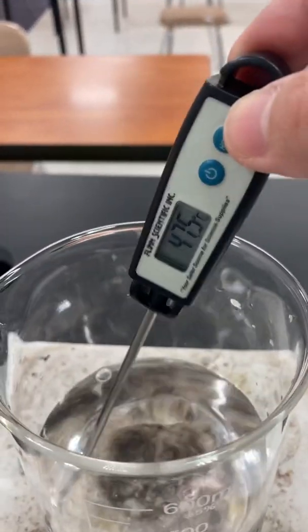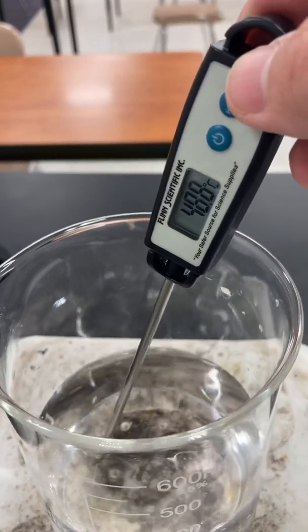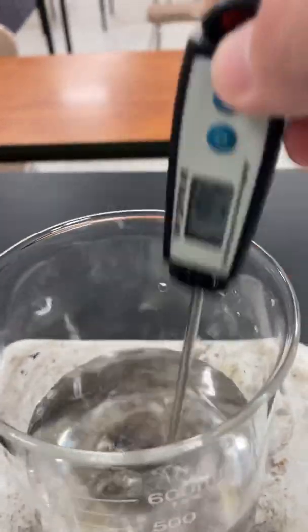It's starting to get uncomfortable to hold my hand here almost. Like, man, this is taking forever. Well, it's only been like 7 minutes. Okay, at 7 minutes, we're at 49 degrees Celsius.